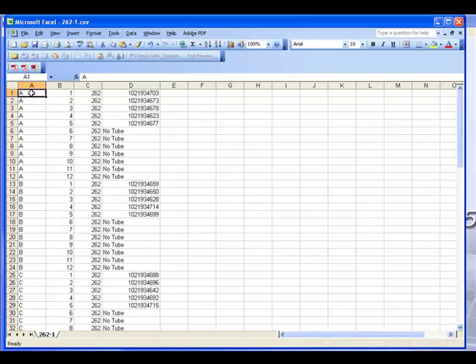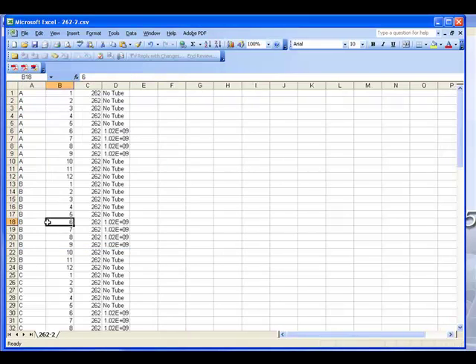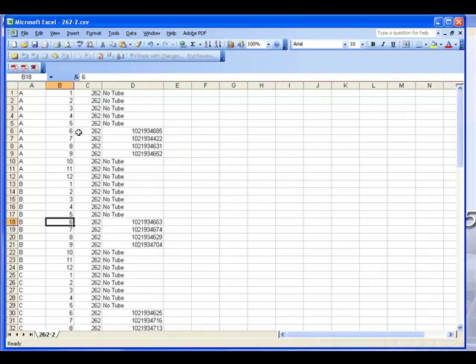So what I did is I've modified 3 import files. The first one you have A1 through 5, B1 through 5, C1 through 5 are filled. And then I open the second one, and you'll see that A6 through 9 is filled, B6 through 9 is filled, and so forth.